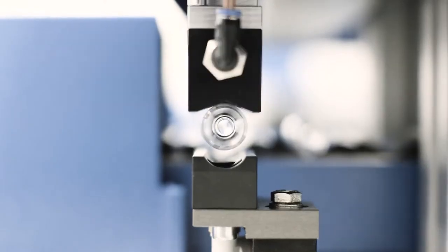Afterward, they are fully automated inspected. The result of the coating process is adding properties into the inner surface of the vial.